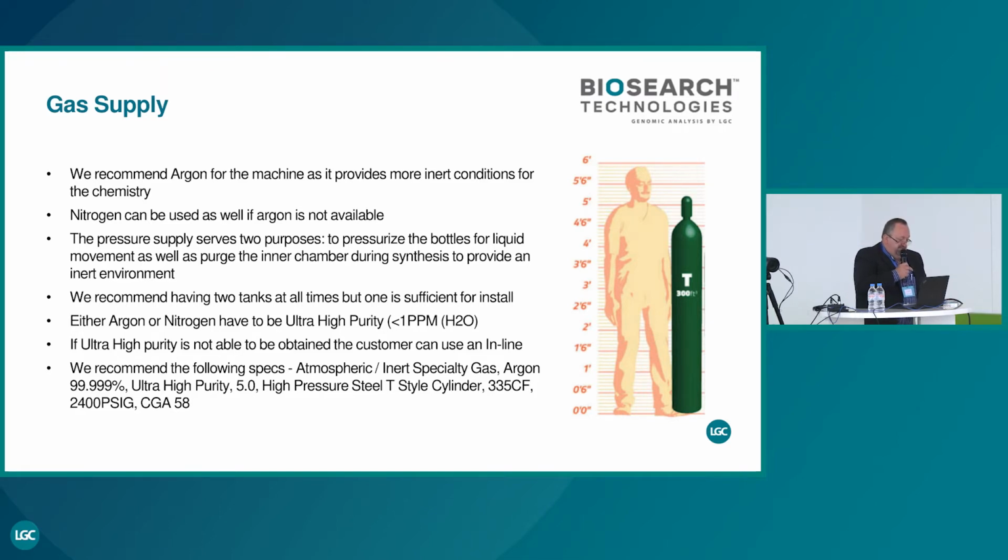I just checked some numbers. If you make a 20-mer and the efficiency of your reaction is 98.5%, you will have 73.9% full-length oligo. If your efficiency of the cycle is 99.5%, you will have 90.5%. So it's very important to see where you can win a few percent.